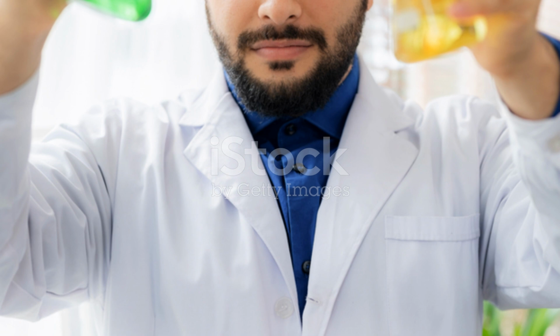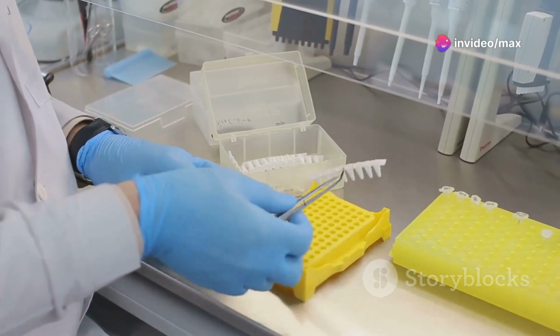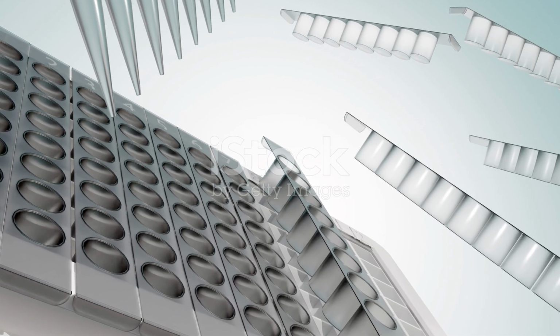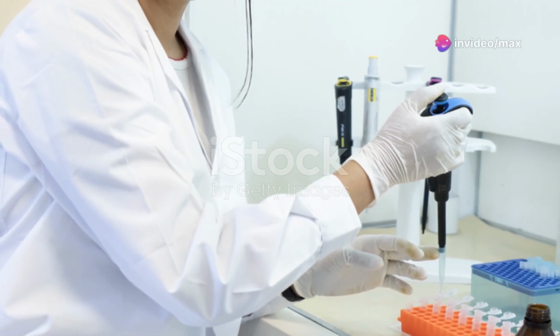The intensity of the color is directly proportional to the amount of target molecule in the sample. This elegant color-changing mechanism is the heart of ELISA. It allows us to not only detect the presence of a target molecule, but also to measure its quantity. It's like having a molecular ruler that tells us exactly how much of something is there.